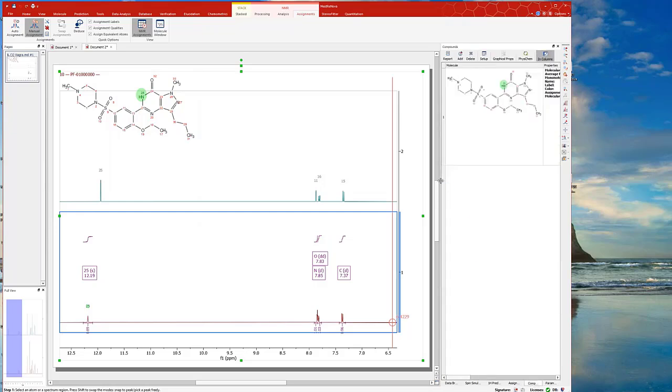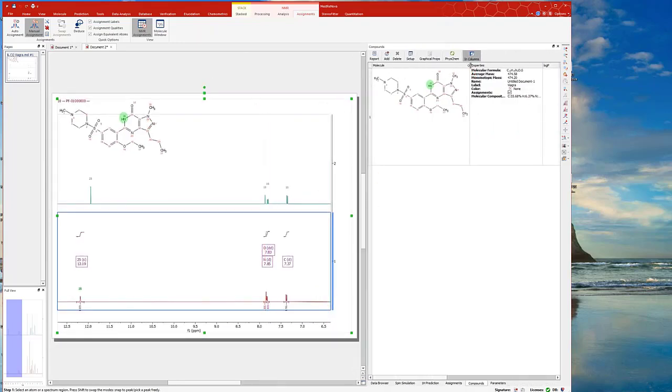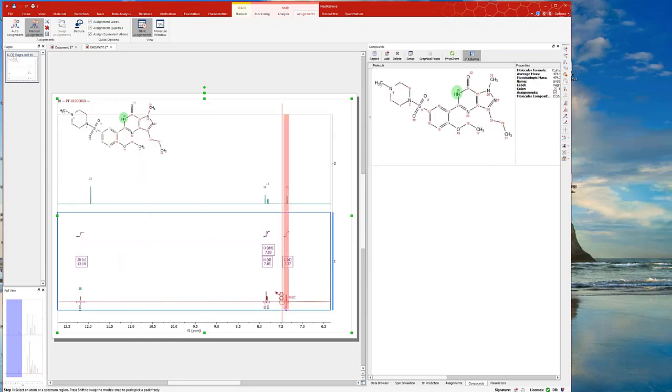Or you can use the compound table to do that as well, right? So either way, from here or from here. So the next one, I have this doublet to the next, and this doublet to the right. So that one apparently is 11, right? So I just click 11 here. And the other one, DD, doublet, was close to 16, right? So I will put it here. And this one, 15, I'll send like this way.